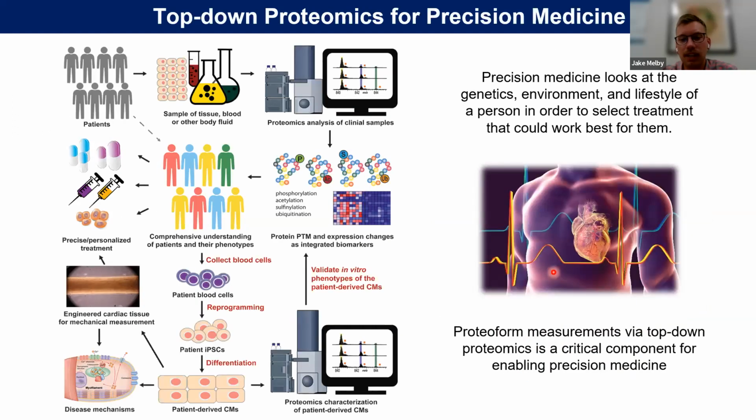So with my remaining time, I just wanted to briefly talk about other projects we've been working on in the lab using the Newomics source. So it's a large goal of our lab, as well as it seems like Newomics, is the precision medicine idea, which looks at the genetics, environment, and lifestyle of a person in order to select the best treatment for them.